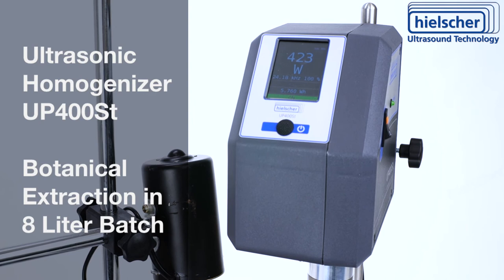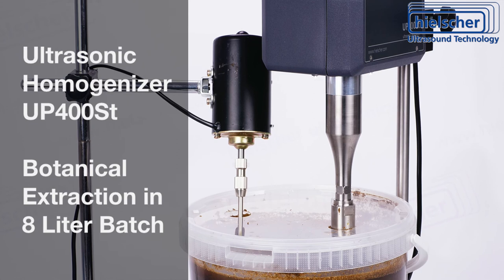The UP400ST produces repeatable sonication runs so that you can make identical batches. Talk to us about your extraction application — contact us today.